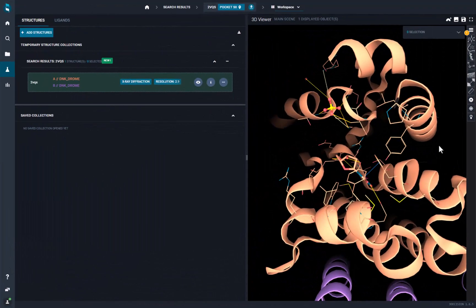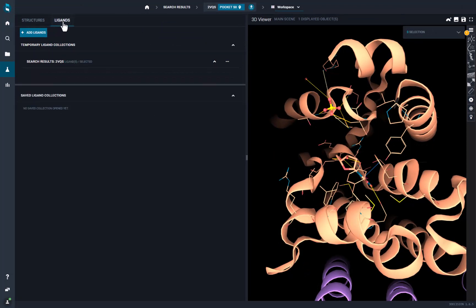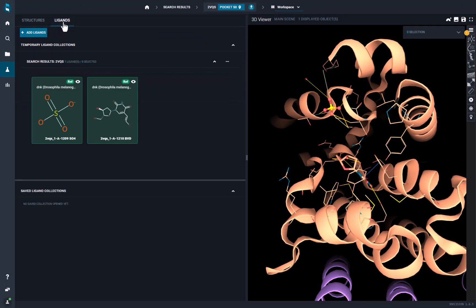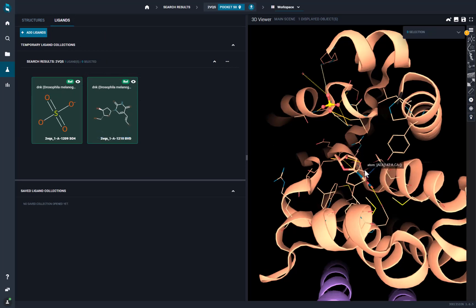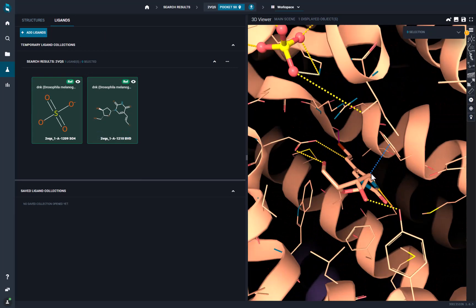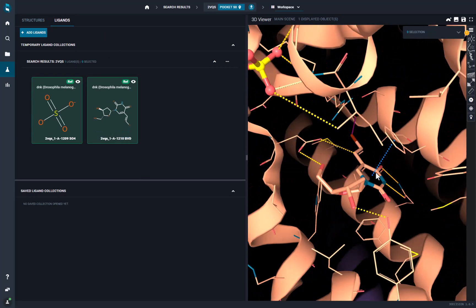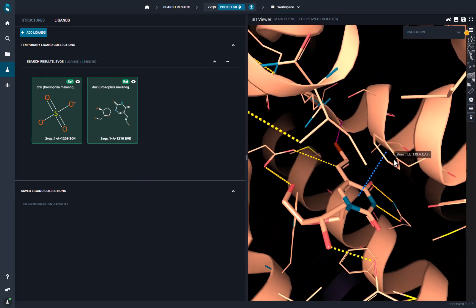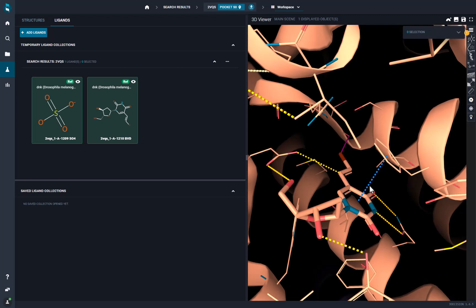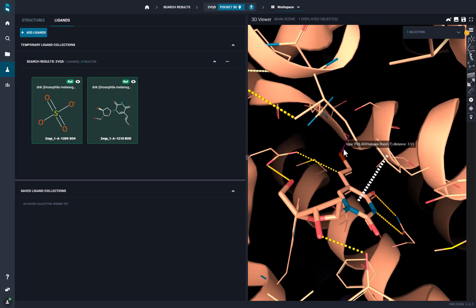The structure 2VQS has brivudine in complex with the protein deoxynucleoside. The ligand forms a halogen bond with the protein by the bromovanyl moiety, and an aromatic interaction by the nucleobase ring. To define a 3D query, we simply select these interactions from the 3D viewer.